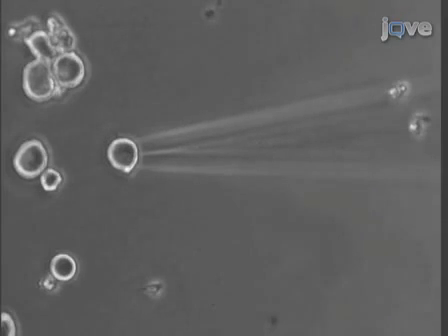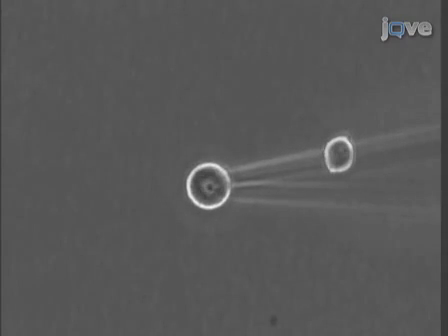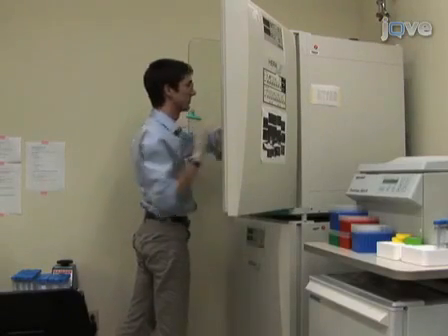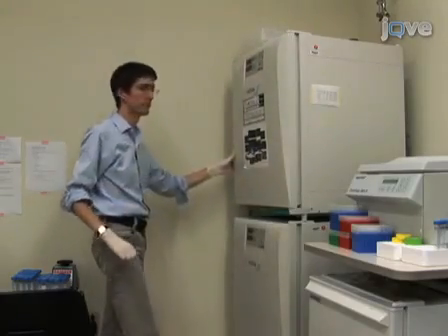Sometimes the microinjection pipette does not penetrate the nuclear membrane and simply nudges the nucleus. If this happens, a second injection attempt at the same position may lead to a successful injection of DNA into the nucleus. Swelling of the cell is usually indicative of unintentional cytoplasmic injection. Once 50 to 100 nuclei have been injected, return the dish of neurons to the incubator for overnight incubation.